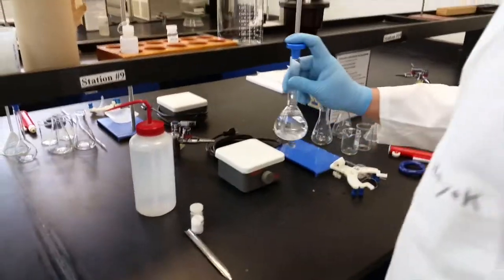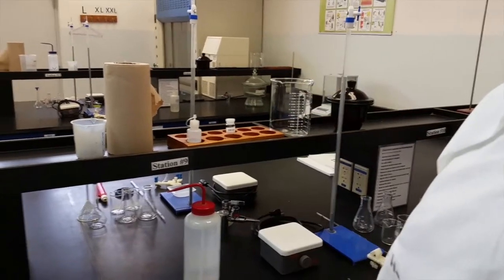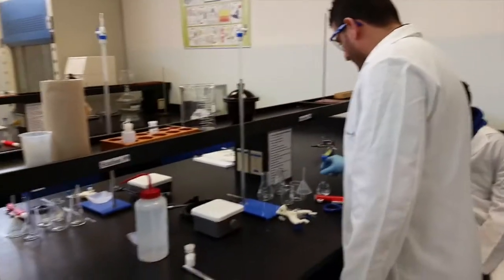Make sure I homogenize it. Make sure there's no solid left inside my solution. So this is my solution.